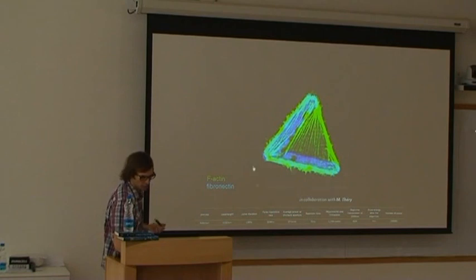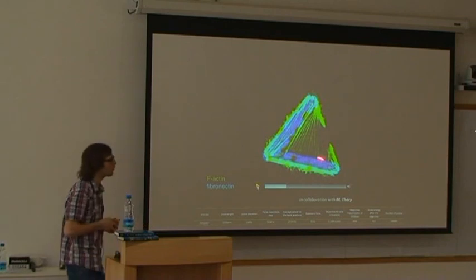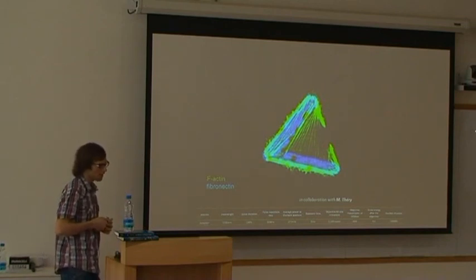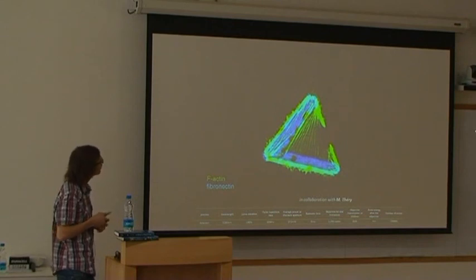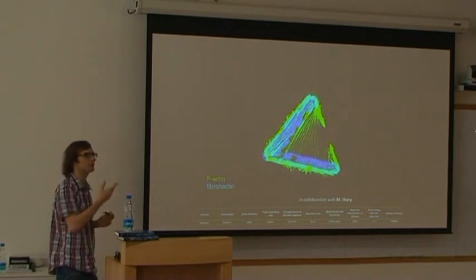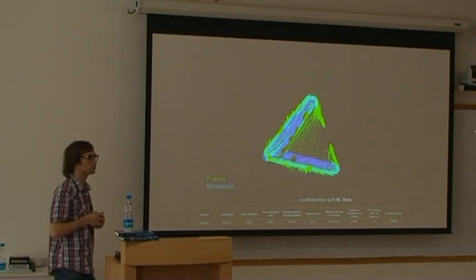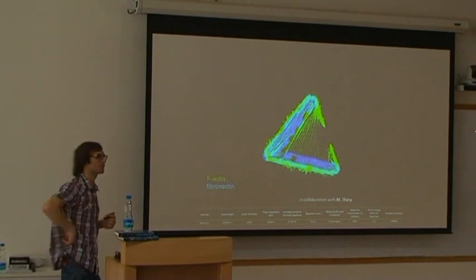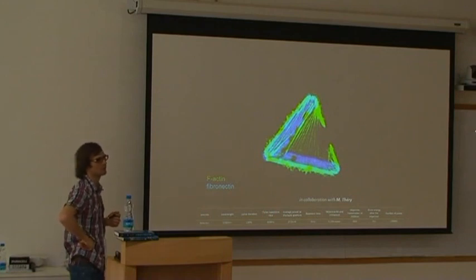So this is just one example. For example, what I did was a dissection of one of the biggest cables in this cell. And it was interesting to see what the output was. So I would like somebody to imagine what the final output is. What kind of shape will the cell take? What do you imagine? I would like somebody to give his opinion, or her opinion.